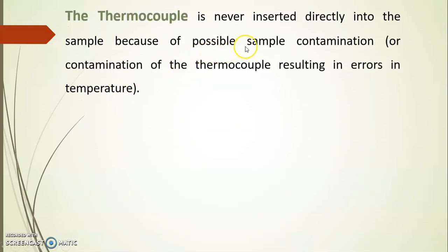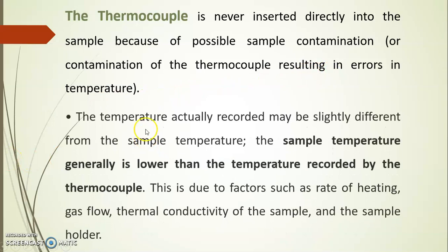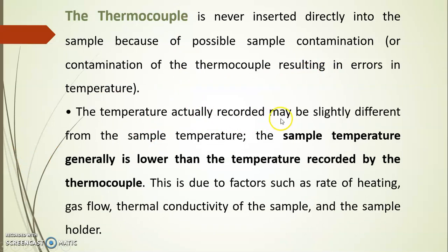The thermocouple is never inserted directly into the sample because of possible sample contamination or contamination of the thermocouple, resulting in an error in temperature. The temperature actually recorded may be slightly different from the sample temperature. The sample temperature is generally lower than the temperature recorded by the thermocouple. This is due to factors such as rate of heating, gas flow, and thermal conductivity of the sample and the sample holder.